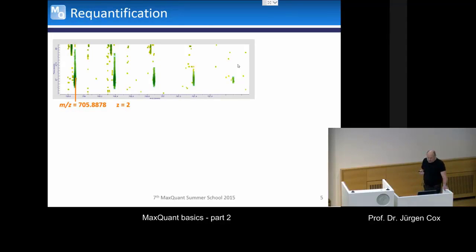So what is this? This is where we are back to the MS1 labeled data, for example SILAC data with heavy and light pairs on the MS1 level. There it for sure happens that some of the isotope patterns in your data are not paired into heavy light pairs.